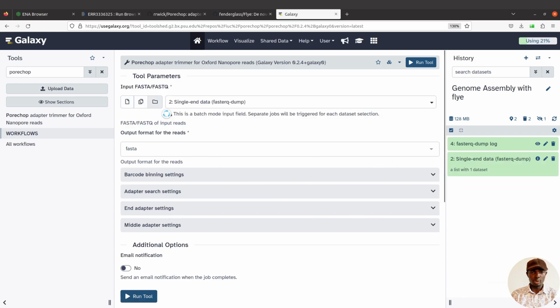So click on dataset collection, and when you click it, you have this dataset collection here. You have the name indicated here. If you don't see it, just click and then select it. But that's what will come, by the way, if that's the only dataset collection you have. So once you see this, you can proceed.